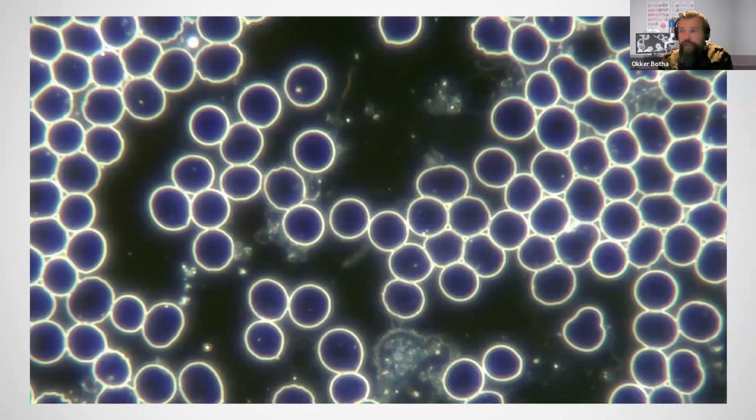Yeah, well, compared to this, we can see, again, looking between the cells, looking at these structures in the plasma, this sort of tubular shaped structure here, and this other long elongated structure coming off this other blood cell here. These are all really important to be able to see. This tells us about what has been going on with the terrain over a period of time. Not information that you'd want to miss, because it really guides you in terms of what you can expect with the case as well.